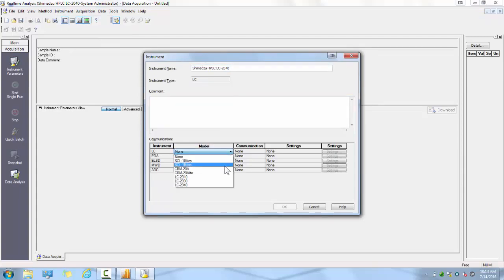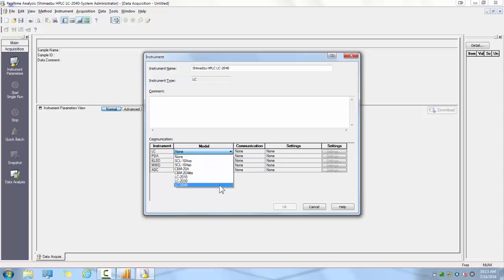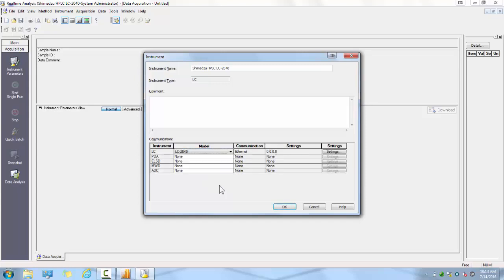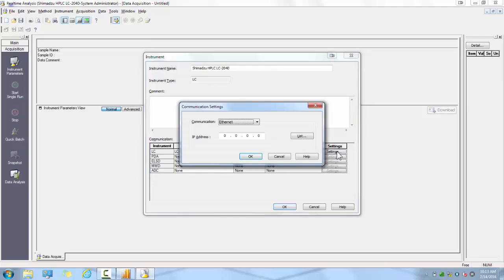Within the screen, you will need to select your LC system, whether that be a modular CBM-20A, CBM-20A Lite, or in this case, an LC-2040 i-Series. Once you've selected your LC system, click on the Settings button. This will let you select your communication settings.